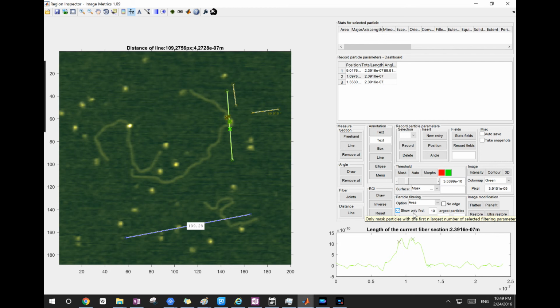Because right click always triggers the context menu, which I don't think is elegant. The middle click is fine. You can use shift plus click to simulate middle click. If, for example, you're using a touchpad which does not have a middle click, you can use shift plus left click to simulate the middle click. So I think that's pretty much it for the measurement. Stay tuned.